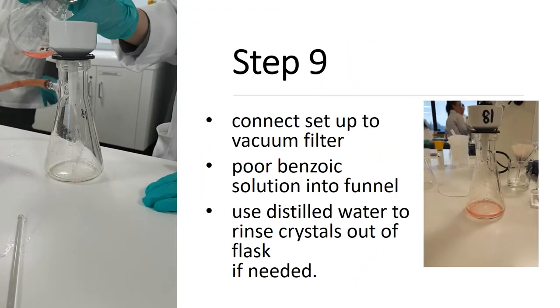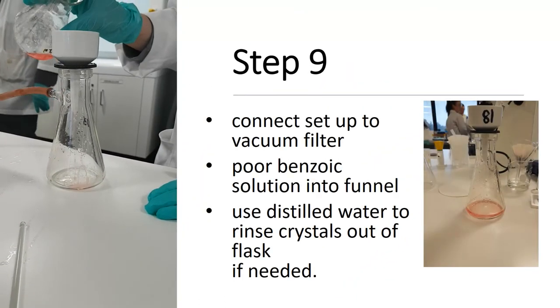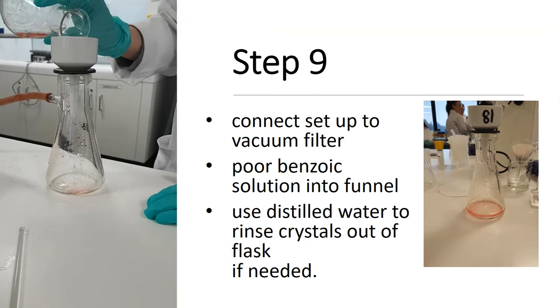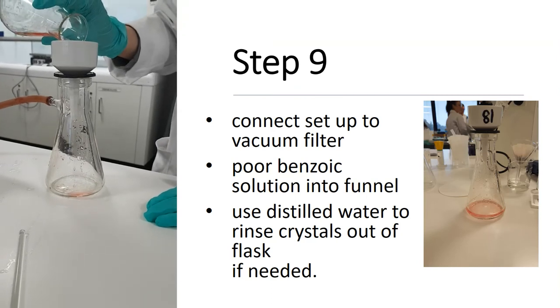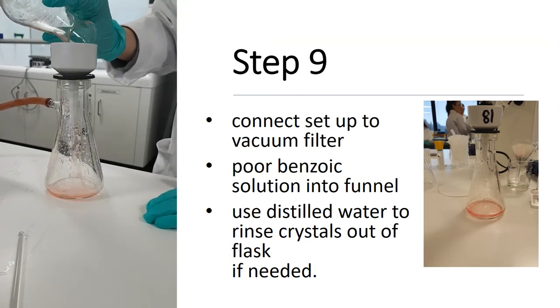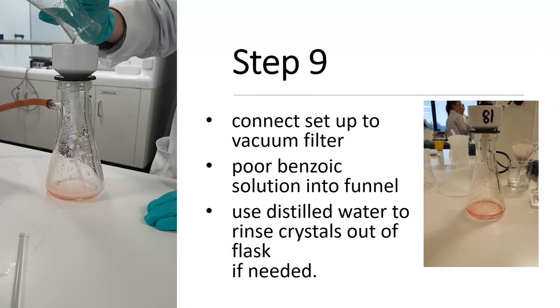Step 9. Using the vacuum filtration method, filter the benzoic acid solution. To get all crystals out, use some distilled water.